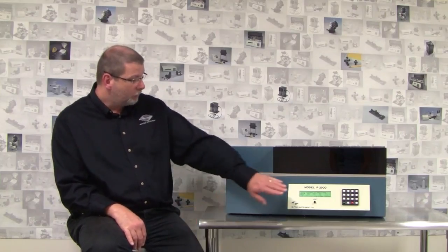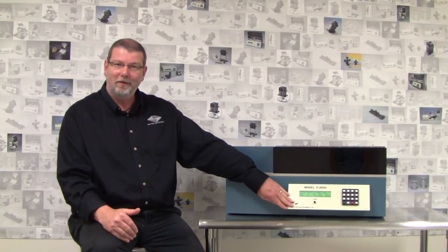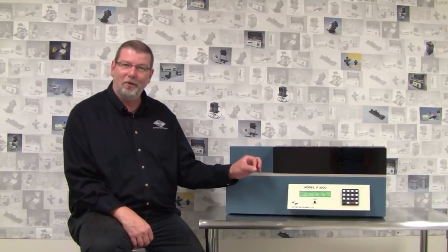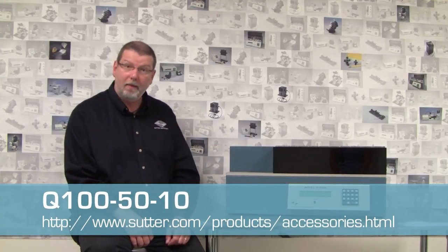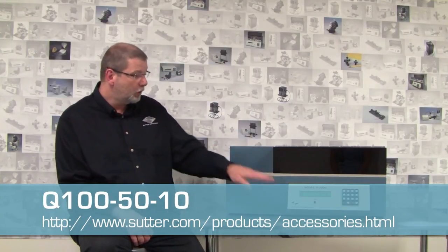Now that we have learned how to pull a patch pipette with a sample program, go out and do it. Keep in mind that program 1 only works with the glass that we have used today. If you use a different type of glass, your results may and will vary, and they may need some fine-tuning even if you use this same type of glass. Enjoy, have fun!